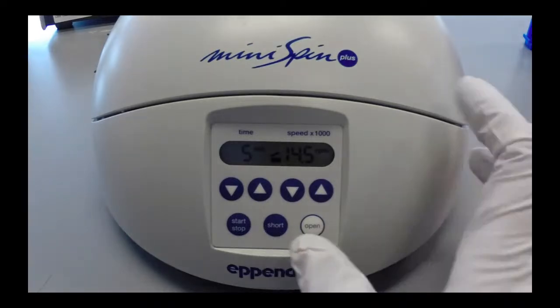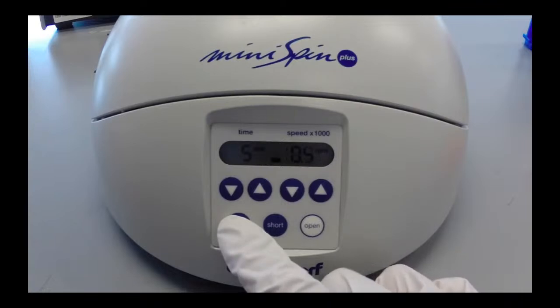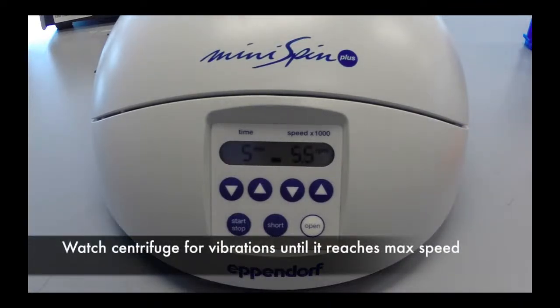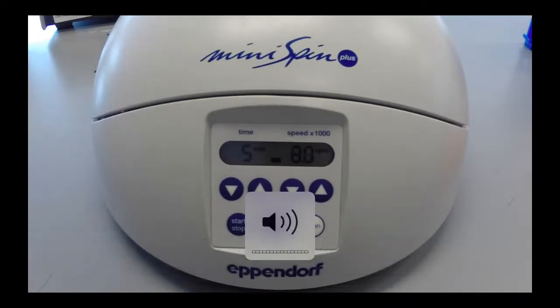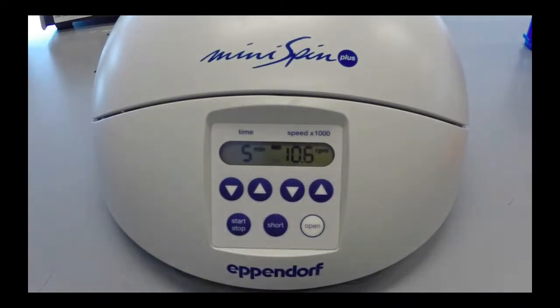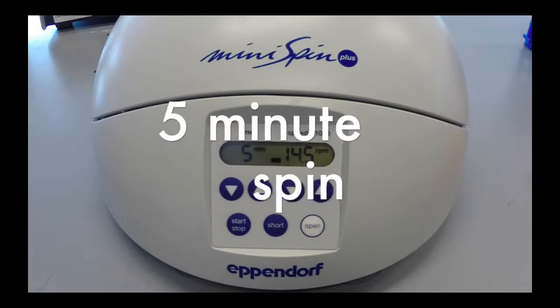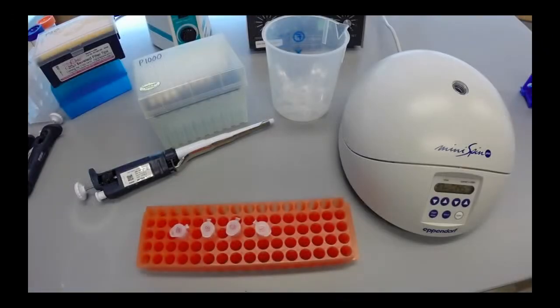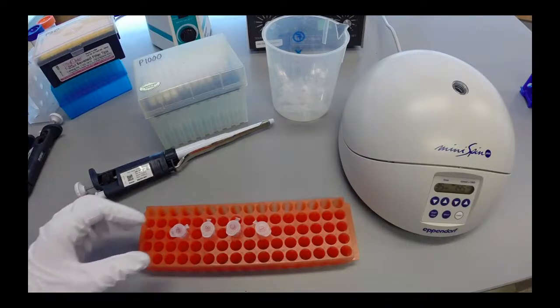Press the start button. The centrifuge will begin to spin. It is suggested that you watch the centrifuge until it reaches maximum speed to ensure that there are no violent vibrations, which may mean that the tubes are unbalanced or the internal lid has come loose. If this occurs, press the stop button immediately. As the spin is going, obtain 4 new tubes and label them.